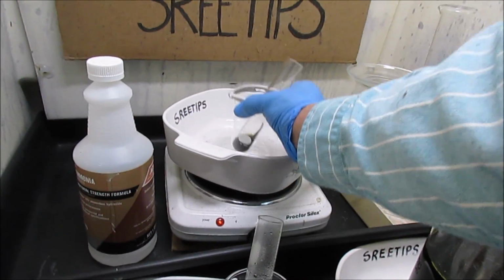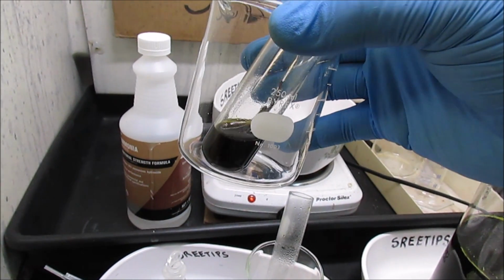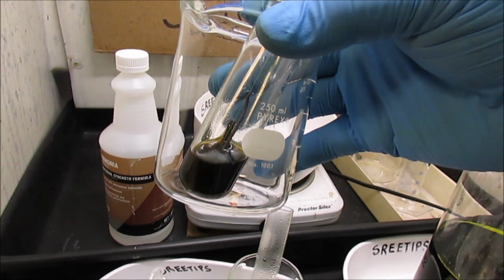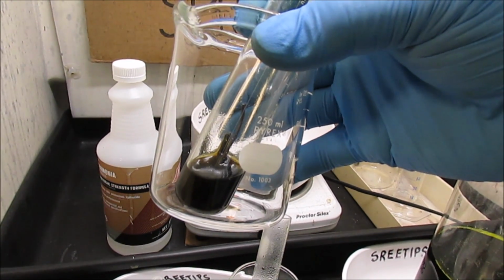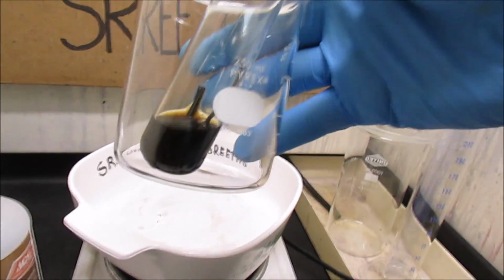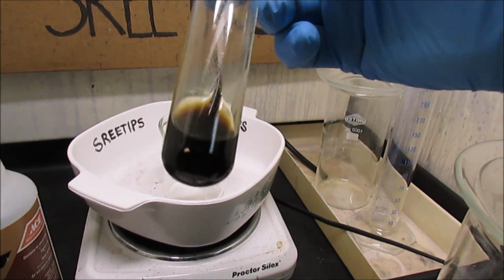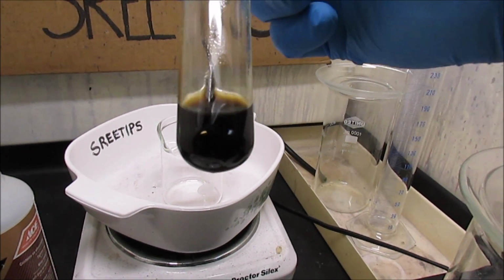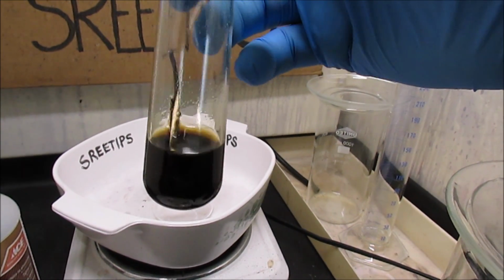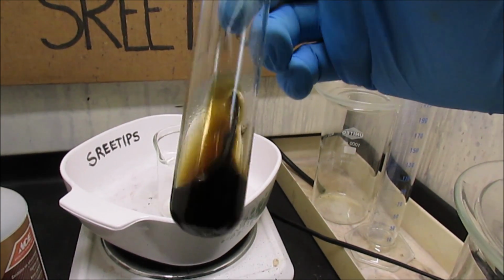The copper up here, using metallic copper, the thought there is that it will cement out the precious metals, but it won't cement out the copper. It'll leave that in solution. But I don't think the copper is going to be reactive enough. It would take too long. It'd be too slow of a process. I'd be right back where I started with black PGM powders in a copper solution. I don't think this is the way to go here.